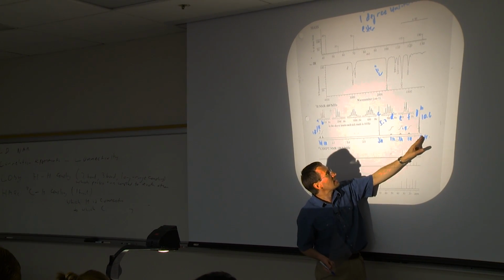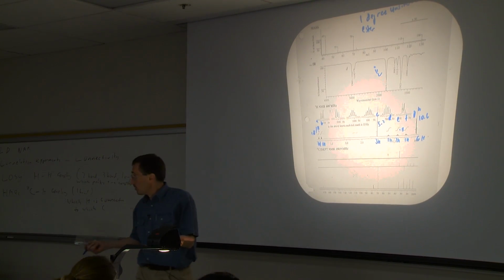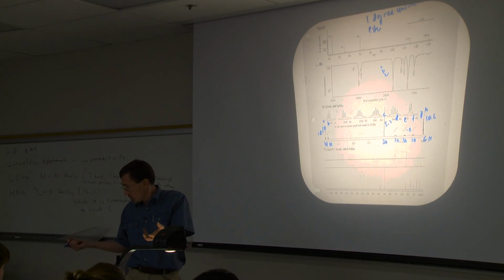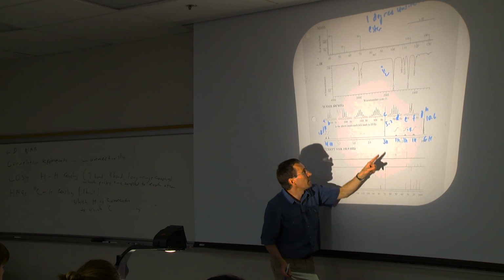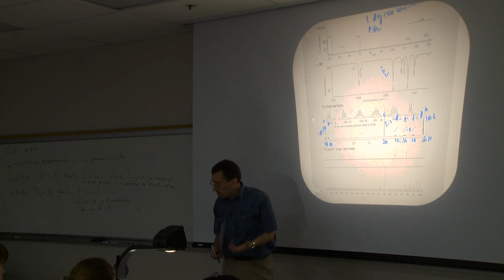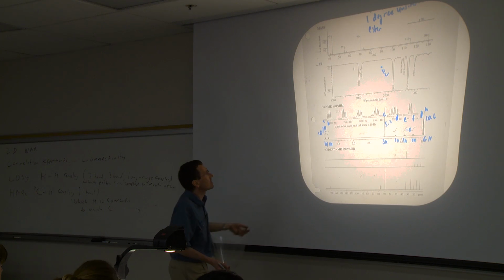I've got a peak that's 6 hydrogens, except it looks like 2 peaks. It looks like I've got a doublet here and a triplet here. Well, it's probably methyl groups. One methyl group is probably next to a CH2 group to make it into a triplet. One methyl group is probably next to a CH group to make it into a doublet. I've got a group over here that's also 3 hydrogens, that's a singlet. That's probably a methyl group. It's probably not a methyl group that's on an oxygen. Might be a methyl group next to a carbonyl. That would make sense, like an acetyl group.